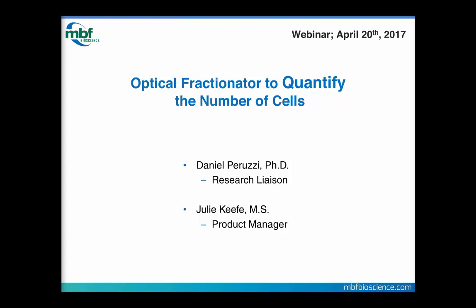My name is Dan Peruzzi, and I'm a research liaison here at MBF Bioscience. I have been for about 12 years, and my job is to help you understand how you can use unbiased stereology to get the data that you need to answer the questions that you're asking in your experiments.